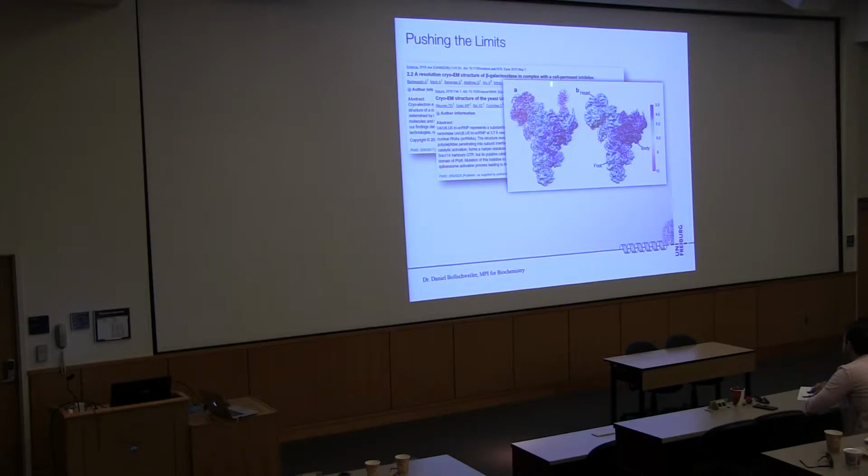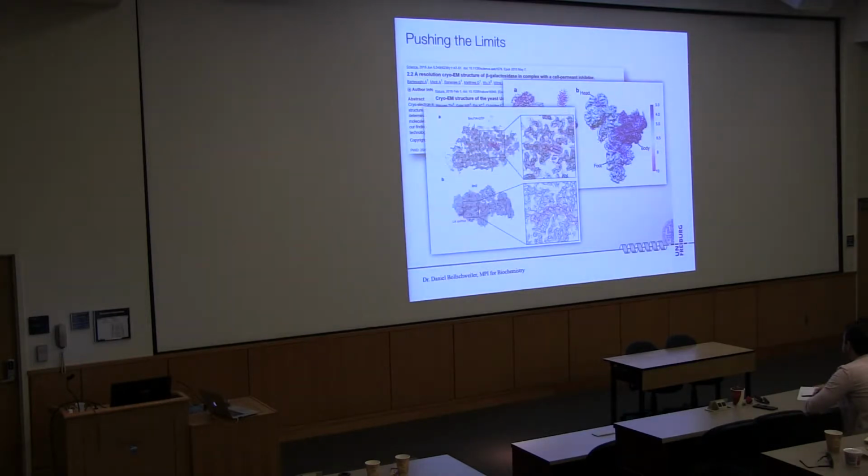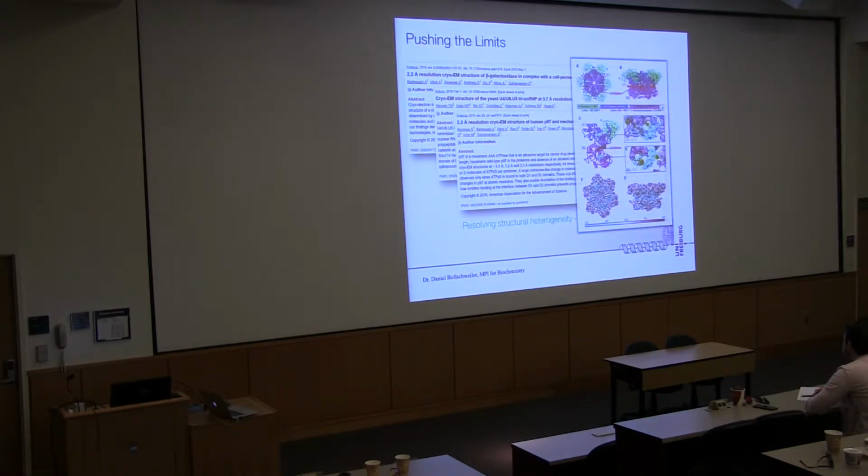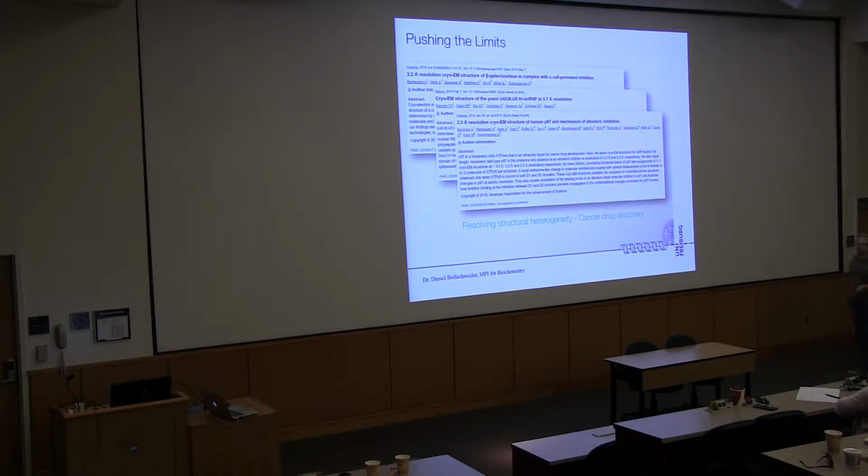Large molecular assemblies that even involve some amount of dynamics give you these maps. Or of course, and that might be rather relevant for application, at 2.3 angstroms resolution, people are saying, well, we can even see ligands binding, and this is where the pharmaceutical industry gets interested. Novartis has already invested in electron microscopes, so let's just buy 2 of the machines and see where this goes. Can't do this in the university environment. But so the developments are actually quite impressive.